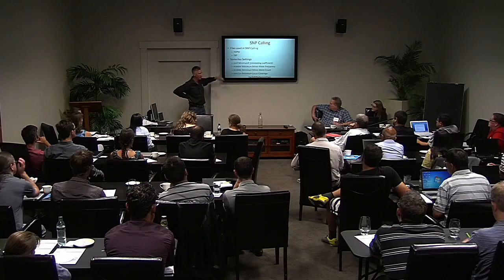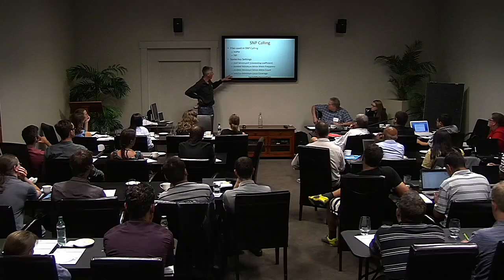They're very similar. Yeah, but these two work together, right? Those two work together, and you have to pass one or the other. So I often set the minor allele count one at a really high level that you can't attain, so that the minor allele frequency is controlling everything. And then there's a minimum locus coverage. And that's sort of how many individuals have been hit by at least one of the tags. So once you're calling SNPs, you're using the set of tags that align to the same start position. So I call that a tag locus.